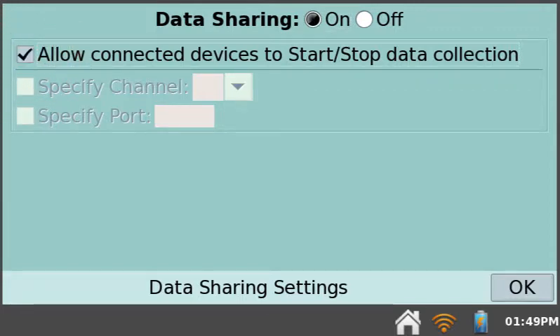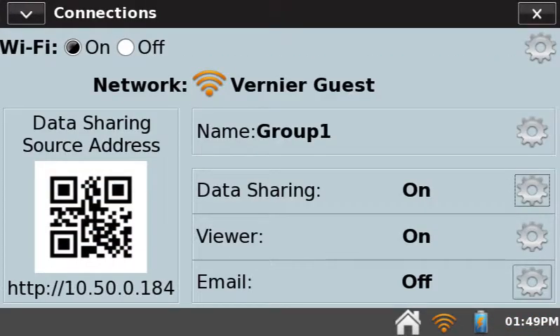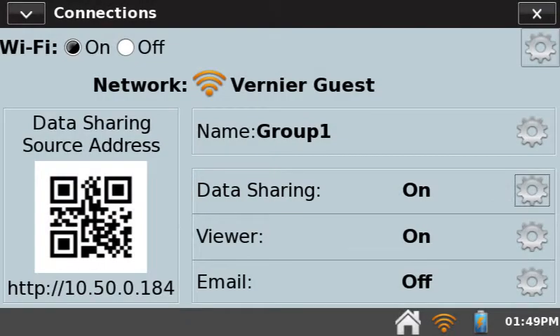Tap OK to close the Data Sharing Settings dialog. Note that the main screen of the Connections app shows that Data Sharing is on. Now close the Connections app.